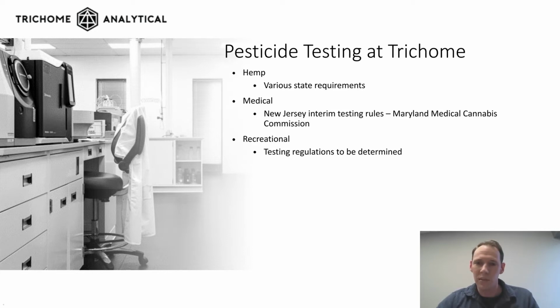And there is a lot of complexity when it comes to multi-residue pesticide analysis. So we are definitely always looking for ways to simplify our methods and harmonize the different testing methods that we utilize in our lab. So recently we were looking for ways to get involved in contributing towards the development of a standardized method for pesticides in cannabis.